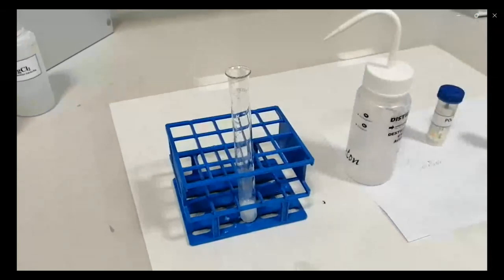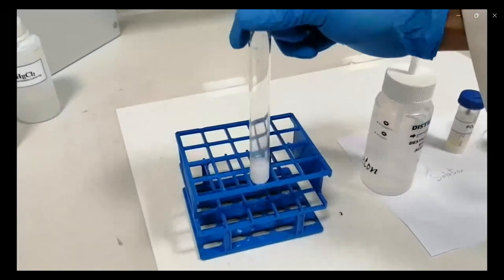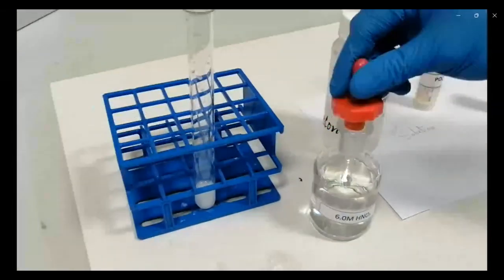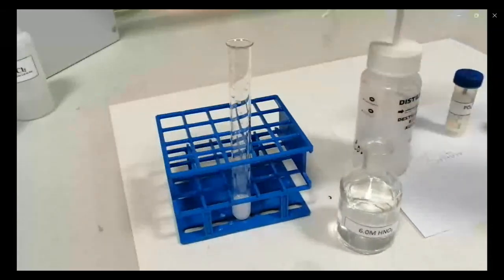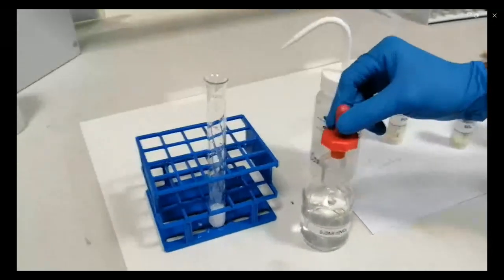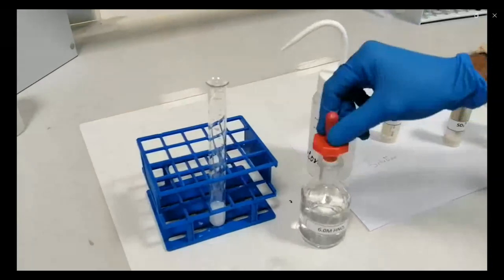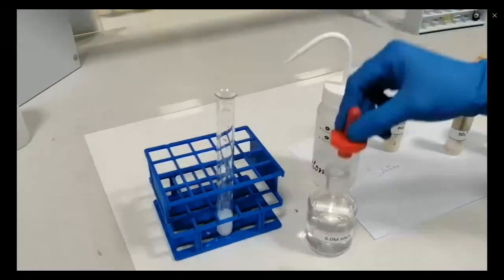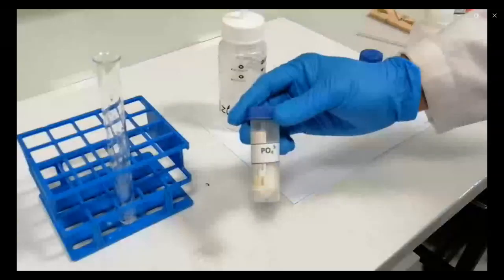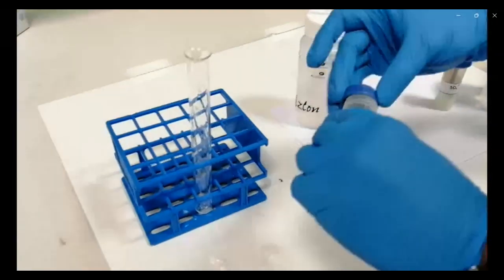You will see a white precipitate which is insoluble in dilute nitric acid. If you add a few drops of dilute nitric acid, nothing will happen. The turbidity is still the same without disappearing. Add nitric acid, another few drops, and the precipitate is still as it is without any dissolving. Why does that happen? Because sulfuric acid is stronger than nitric acid.